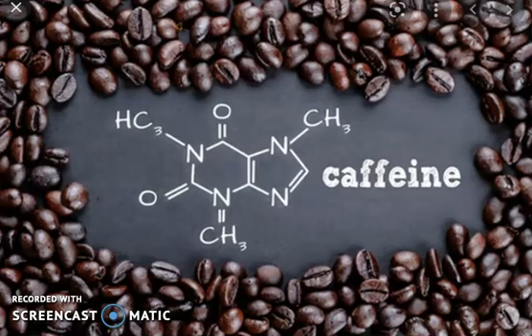So, my friends, the sublimation will be performed as described, so perform it carefully. You will use 50 milligram of your caffeine to make the salicylate derivative and sublime the remainder.